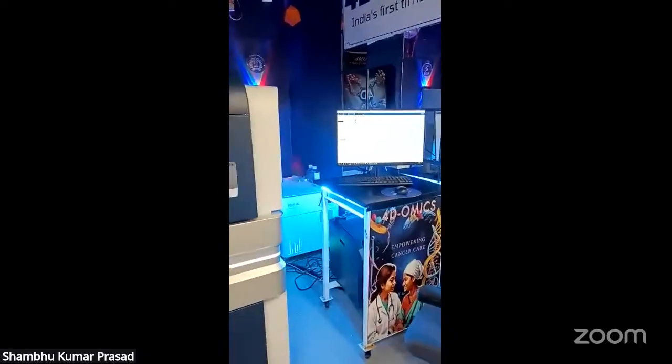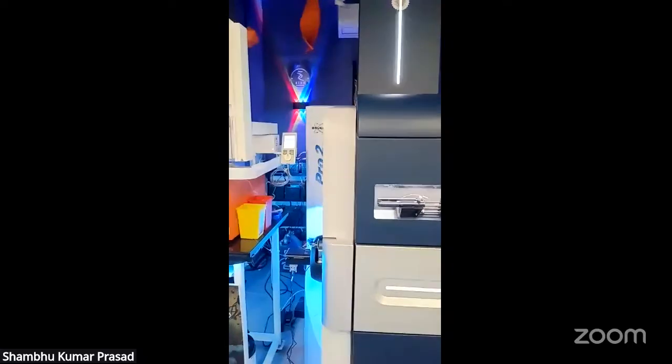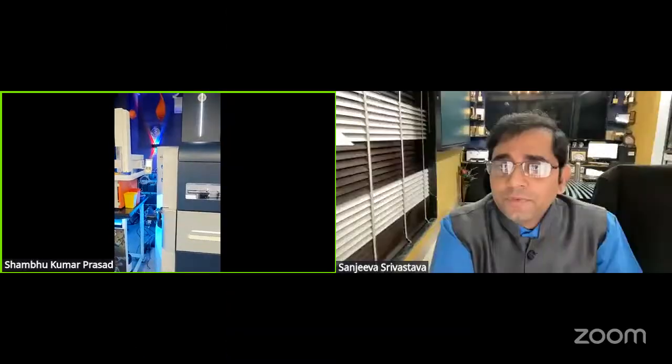I'll quickly tell you that while we have talked to you about many types of arrays and many types of label-free biosensors, in addition to that, there are many mass spectrometry-based approaches which are coming forward, and those are quite important for us to start knowing about and start thinking how to utilize them for your interactomic analysis using mass spec. For example, affinity purification-based mass spectrometry, APMS. Many types of proximity labeling-based approaches are also getting more and more interest and attention. Various types of cross-linking mass spectrometry-based approaches have also come forward to look at much more structural interactomic approaches.